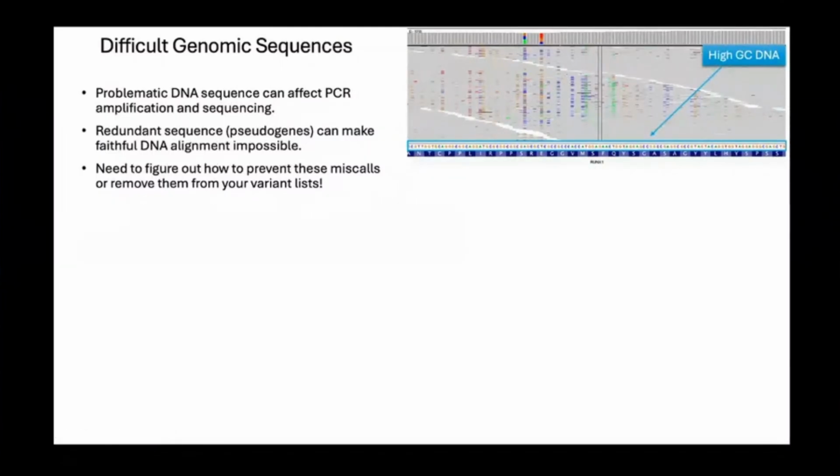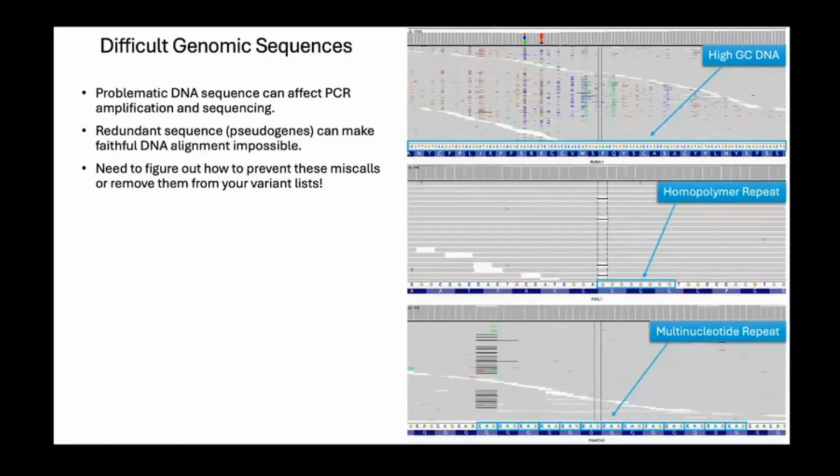Short tandem repeats are also an issue, whether it's single base repeats or trinucleotide repeats like this. These are sequences that are notoriously prone to polymerase copying errors. So they can accumulate errors before the sequencing or during the sequencing and give you false positive length affecting changes. And all these things on the right are local sequence-based motif errors.